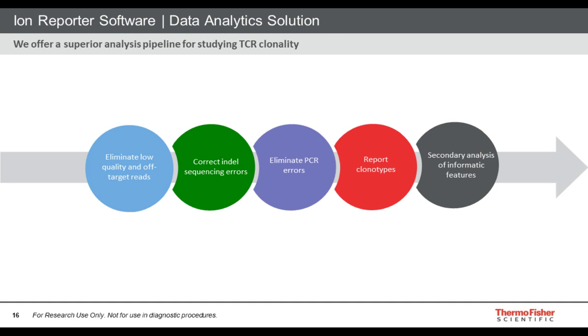In this case, that's quite fortunate because those are readily identifiable as being present because they cause the length of the sequence to change. We're able to analyze the alignment and our knowledge of where our errors are likelier to occur in the sequence to correct those errors, as a result getting, in the case of sequencing RNA in particular, especially high accuracy on the underlying reads.